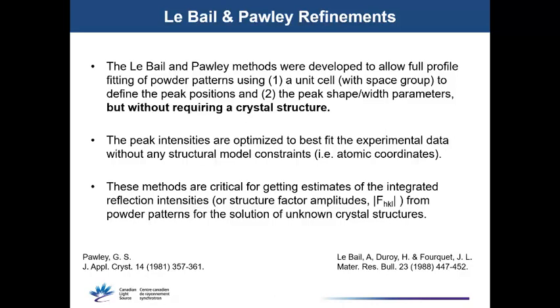And similar to Rietveld refinement, these methods work best when you know your instrument resolution. So you know the geometry very well and you've got instrument parameters, but you can also use them to get an estimate of the profile parameters for your instrument as well.